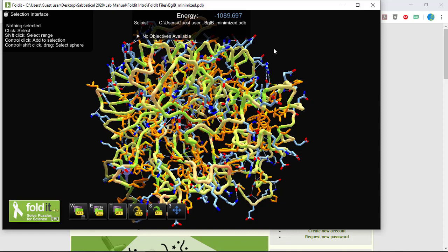As we make changes to the protein, we'll want to pay attention to this score. The more negative it is, the more stable the protein structure. Going less negative means the protein is less stable. This cylindrical tube-like part of the structure is the polypeptide backbone. And the different colors along the backbone, from green to a kind of peach to faint red, are reflecting the energy score or relative stability of that bit of the polypeptide, where green is more stable.